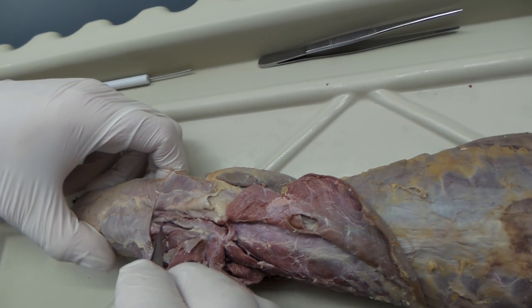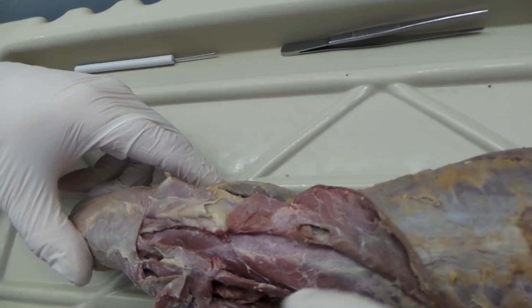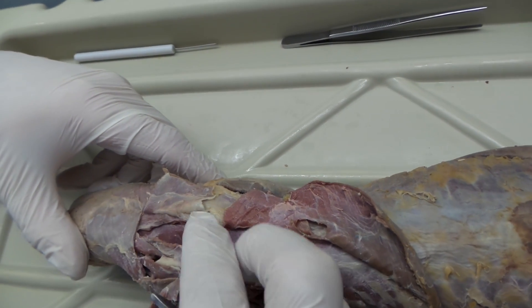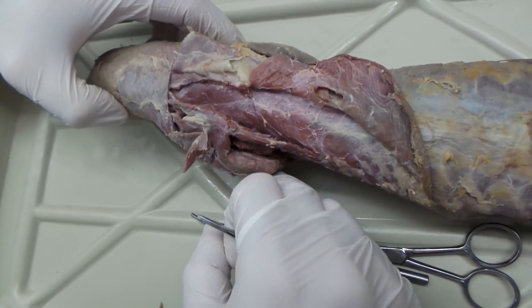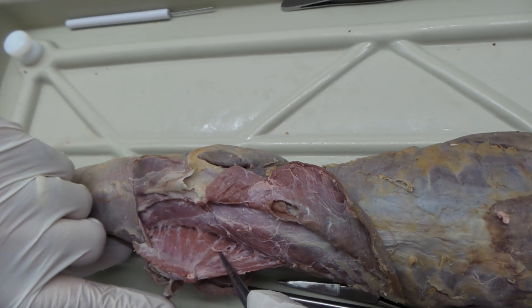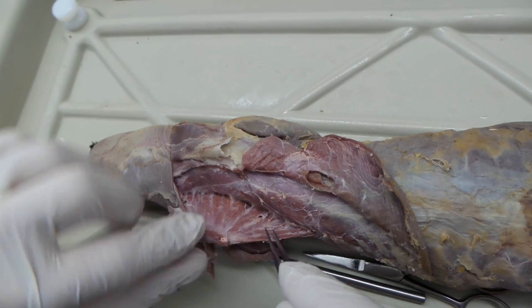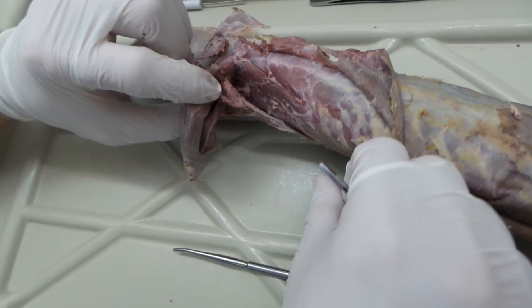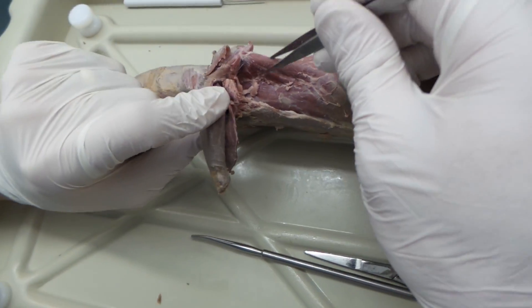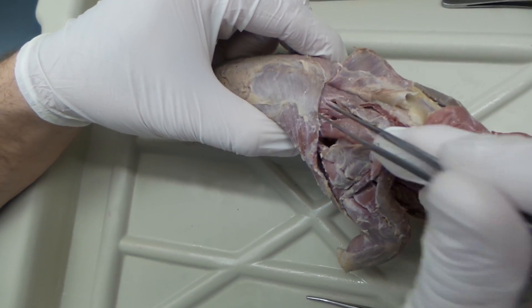That's the rhomboideus minor, and this is the rhomboideus capitis. What you want to do is pull the elbow down, then cut through the rhomboideus major and minor — leave the rhomboideus capitis in place. As you pull down, you can then begin to see this big muscle right in here: that is the serratus ventralis. Be able to identify it from this view as well as with the arm lifted. So we have serratus ventralis, rhomboideus major, rhomboideus minor, and rhomboideus capitis.